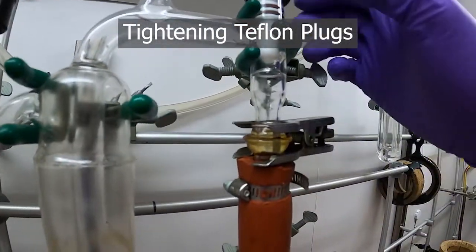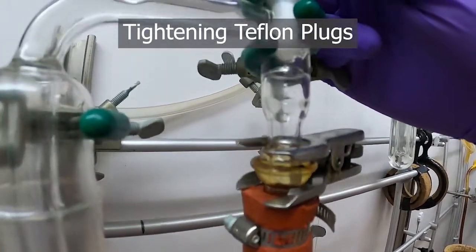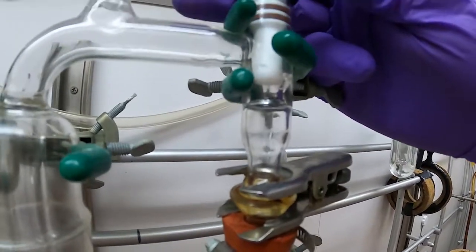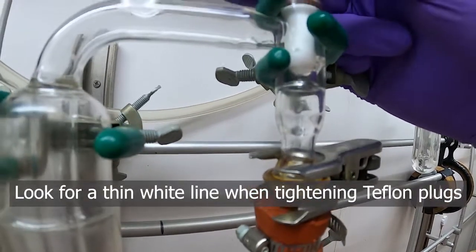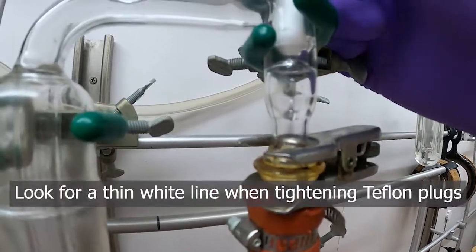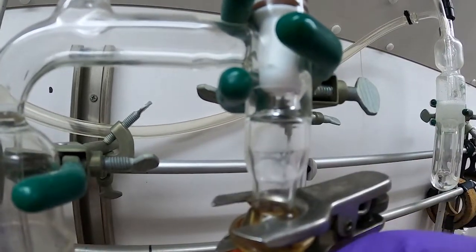So Teflon stoppers are notorious for being easy to over tighten. So you can look at the stopper itself and you can see this kind of thin white line up here on the glass. About right there. You can see that. That means you've got a good seal and that's all it takes.